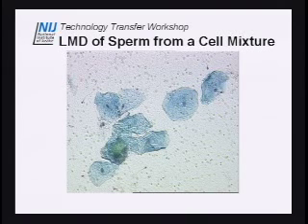One, you're not doing it with a cover slip, two, you're looking through a glass slide, and three, there's also a pen film that creates architecture. So there are some little hurdles that you'll have to overcome and get used to when looking at these particular slides and identifying your sperm.